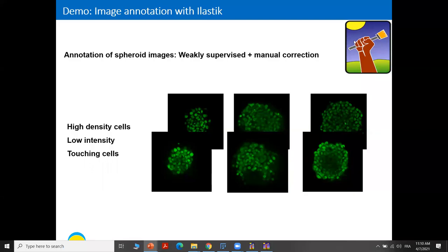Hello. This video is a demonstration to learn how to use Ilastik for image annotation and manual correction. I choose to use in this video the spheroid image as an example, where the manual annotation task is very difficult due to the high density of cells, the low intensity, and the touching cells. So let's see how we can do this task using Ilastik.